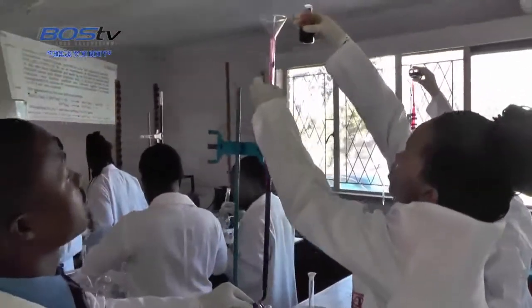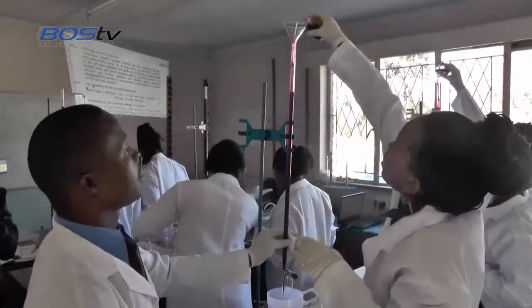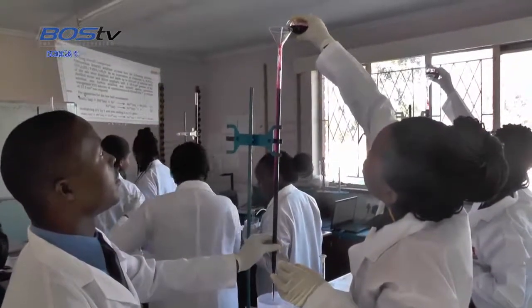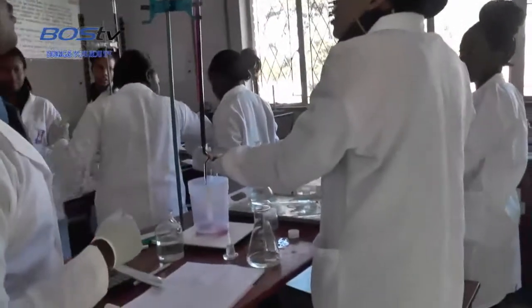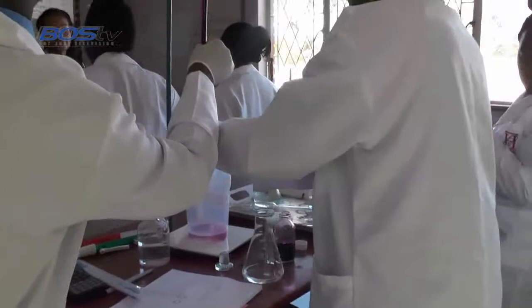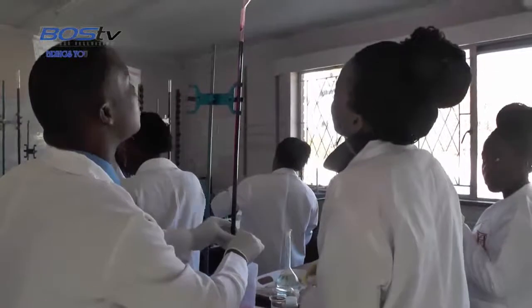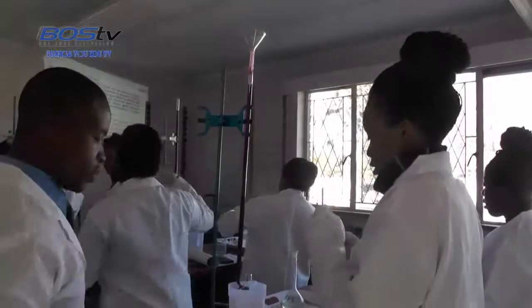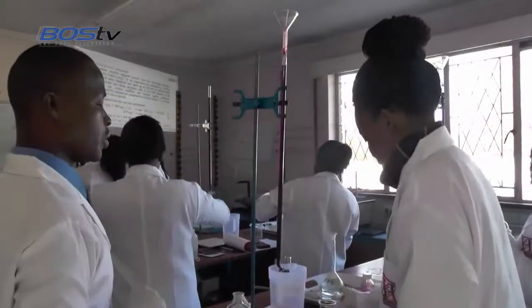Don't start from the zero mark, just any mark you can. Start from 0.2, not your initial reading, it's 0.2.